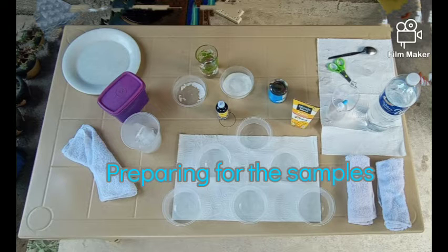The water activity is a useful tool for monitoring quality product and safety for food in an unfrozen state. The video is intended to re-educate the people on the relationship or connection of the topic we have chosen, freezing of water and water activity. The samples that will appear will be showcasing the different types of water activity in freezing of different kinds of liquids and additives.